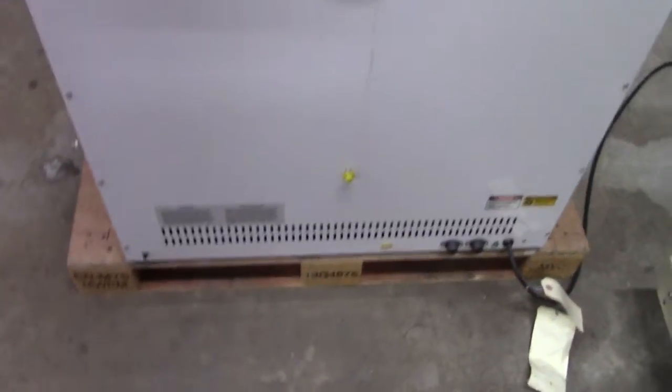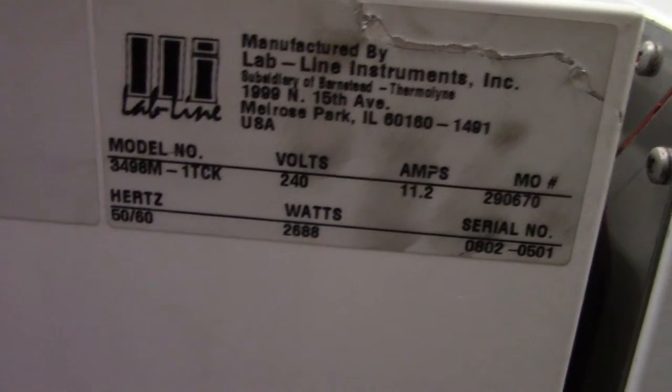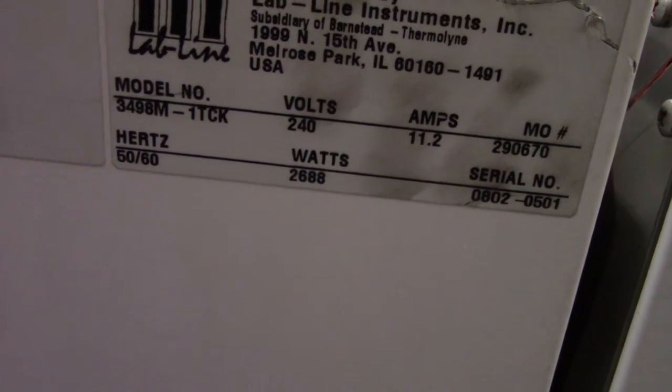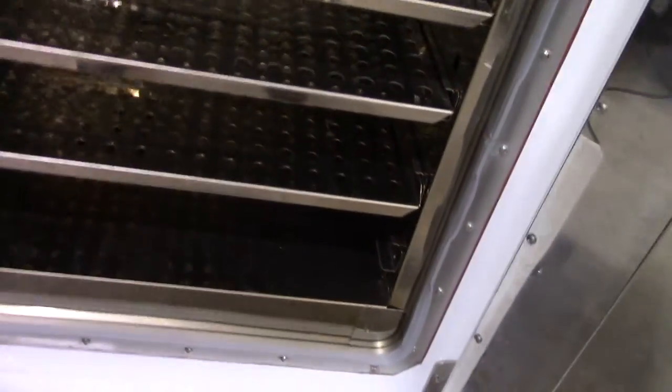On the 240 volts. It has 5 shelves — we took a couple shelves out. Looking inside, it has a total of 5 shelves, with 2 on top. The fans are working nicely, heat's working nicely.